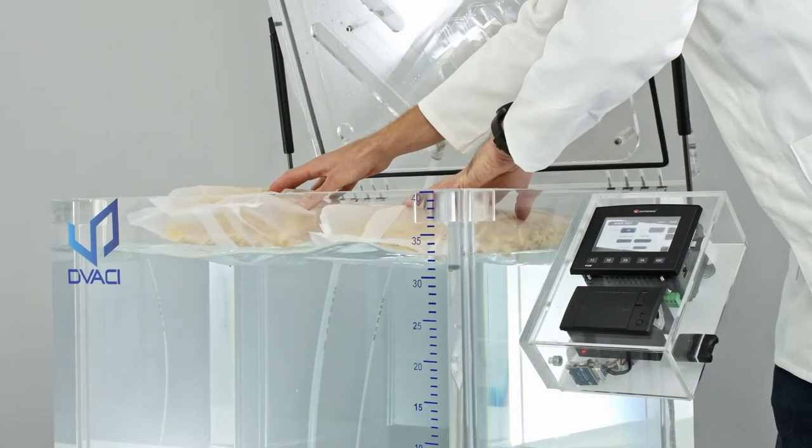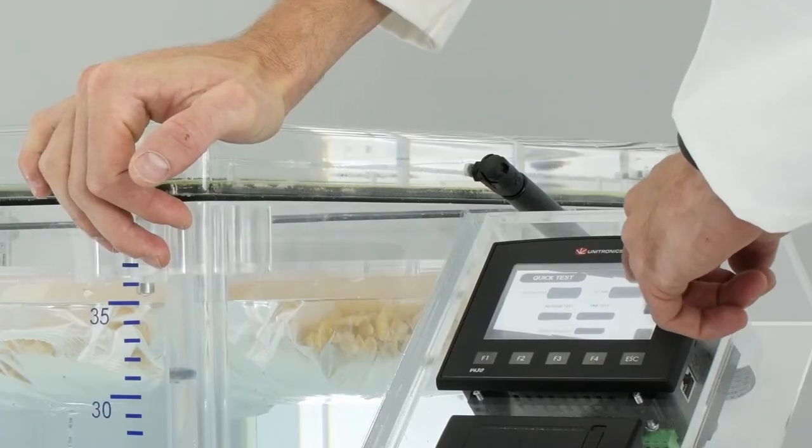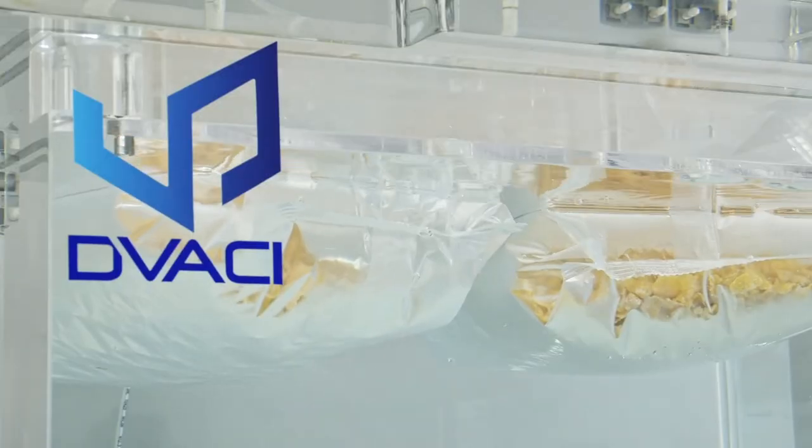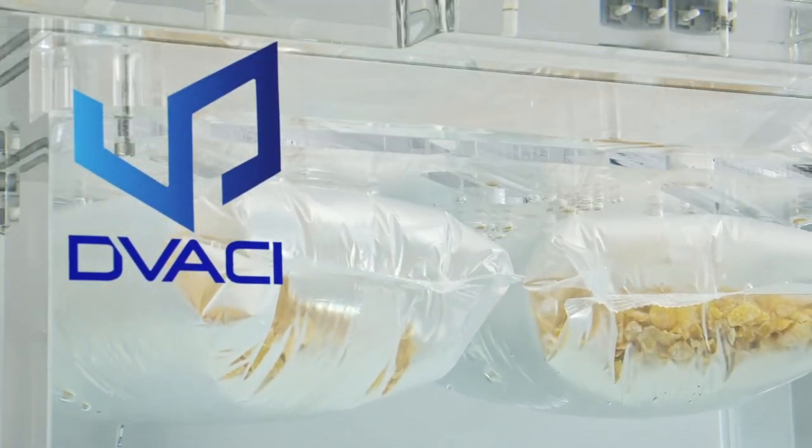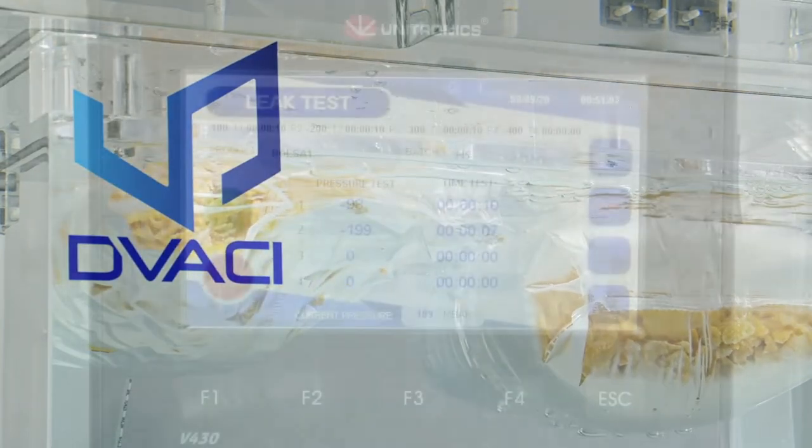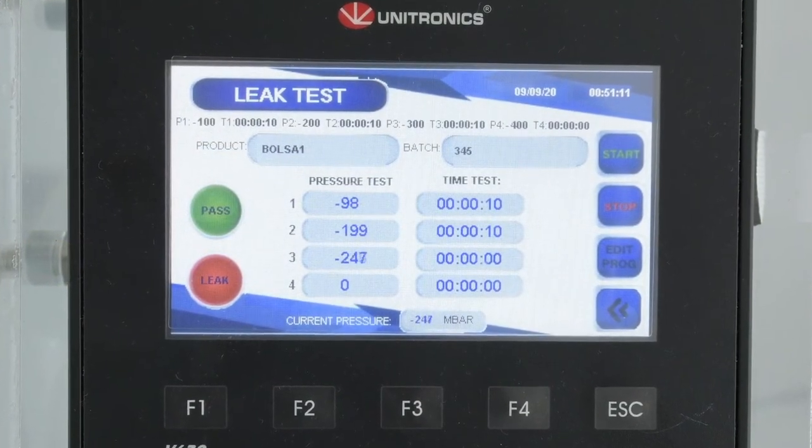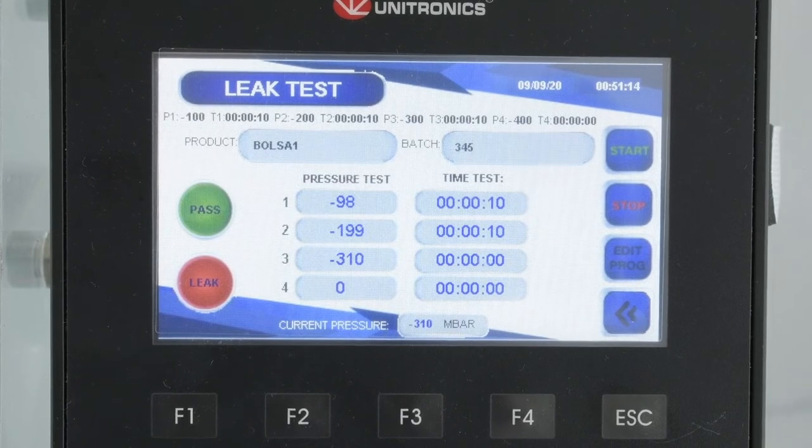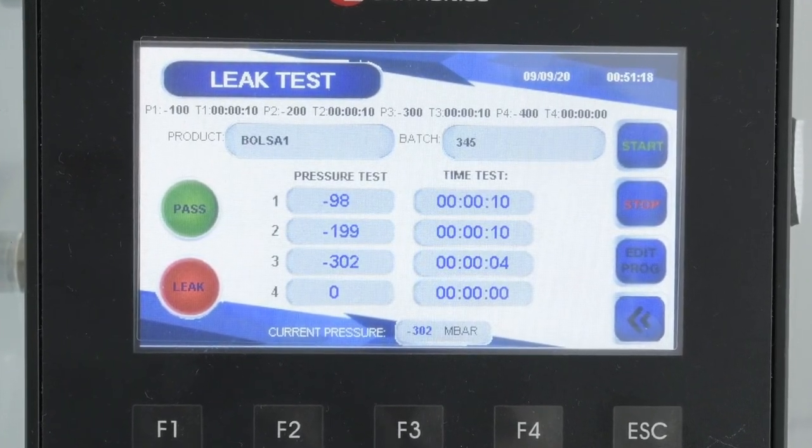We recommend using different stages of vacuum to ensure that all possible points of failure are accounted for. There is a possibility that a package starts leaking at, let's say, minus 100 millibar. We should maintain this vacuum level for at least 30 seconds. If there is no visible leak, move on to the next vacuum stage, each time getting closer to the maximum vacuum level previously determined.